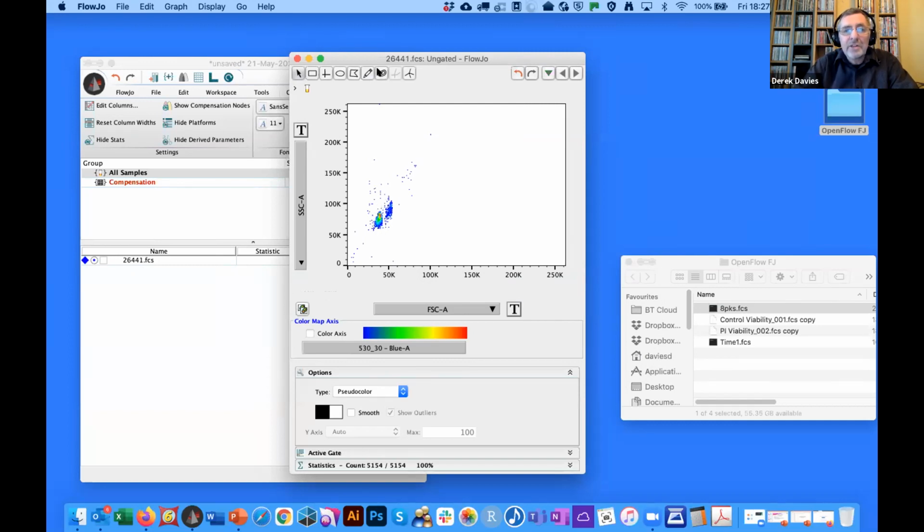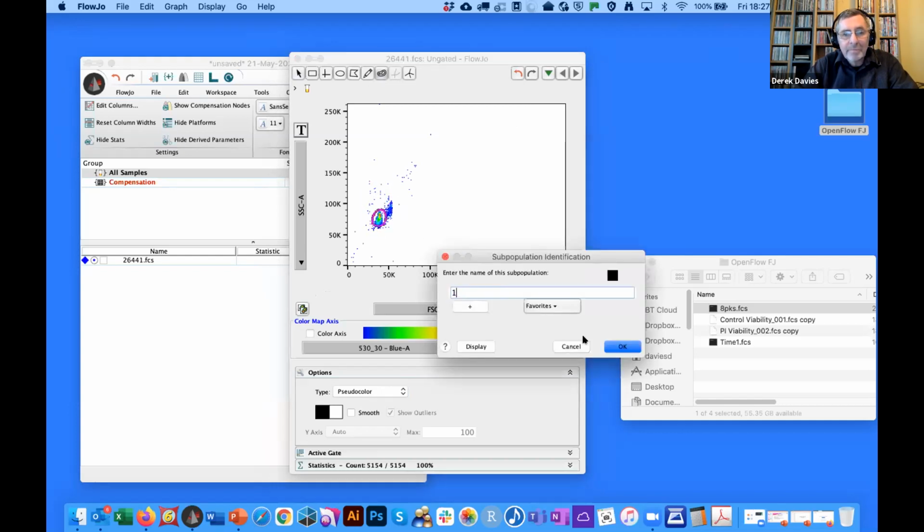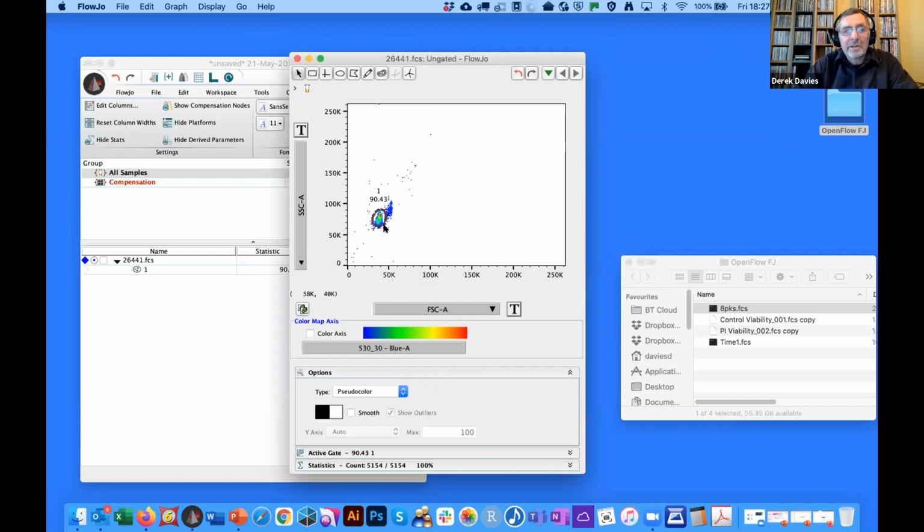The other thing I can use is this thing that FlowJo calls an auto gate, which, as you can see, is like a bit of like the BD snap to gate, which some people like to think is maybe a little bit more objective, but you still have to make the decision about how big or small you make that. So there are multiple types of region I can set there.